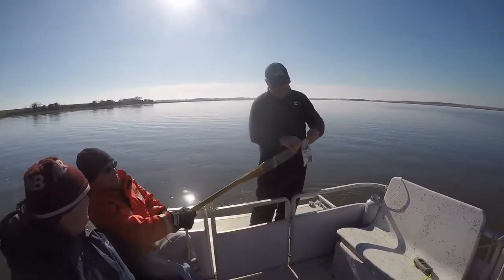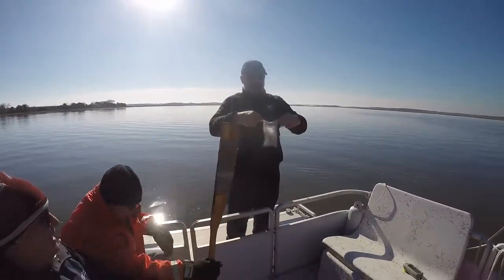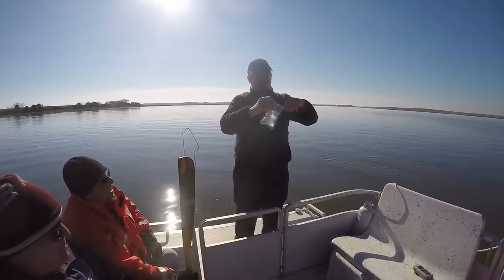Hold it. Ghost. Twist. Twist. Close. Look at that guy go.